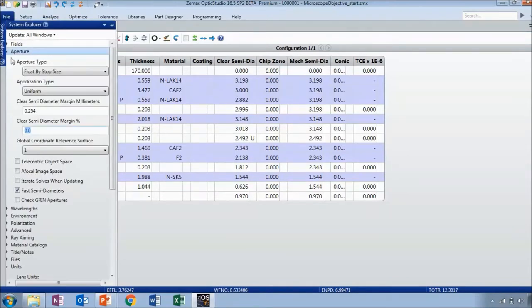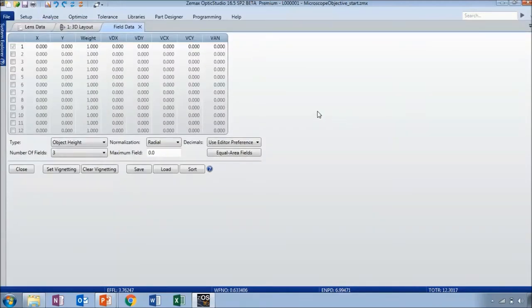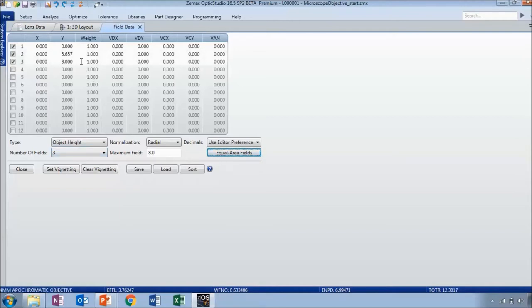Next I'll set the fields. Because my object surface is a finite distance away from the first surface in my lens data editor, I can use the field type definition of object height. Because I need my full object diameter to be 16 millimeters, I can set the maximum field or half field to be 8 millimeters. I'll use the equal area fields button to automatically calculate an intermediate field point. Now we have three active fields all with a weight of one.